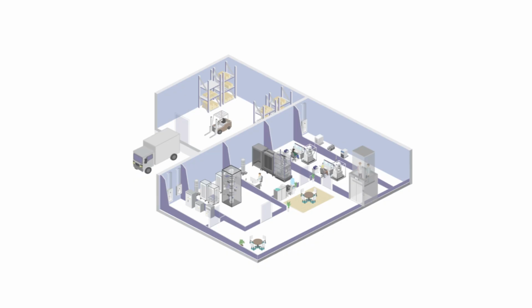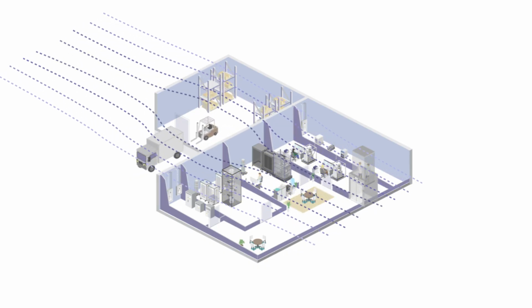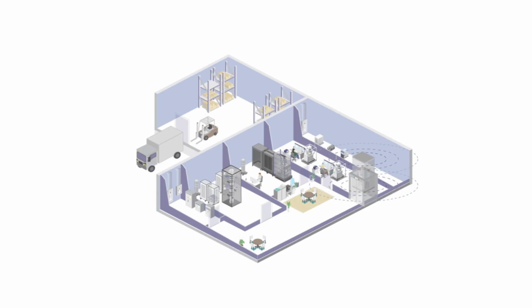So when we're talking about DC field sources outside the laboratory, we're also looking for movement of large ferromagnetic objects. So if you are adjacent to a loading dock with significant forklift traffic, that can be an issue. If your lab space is adjacent to an elevator bank, this is a problem.